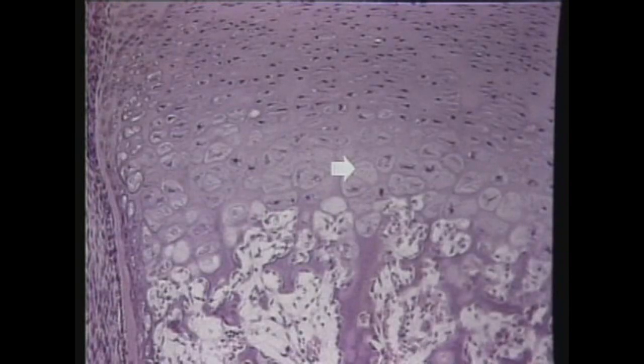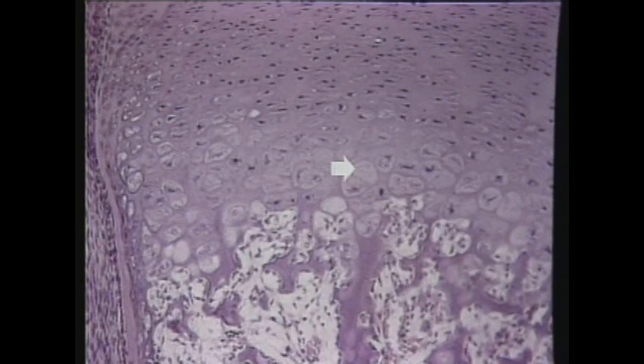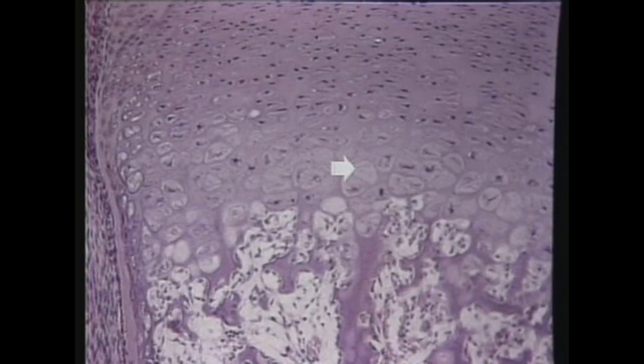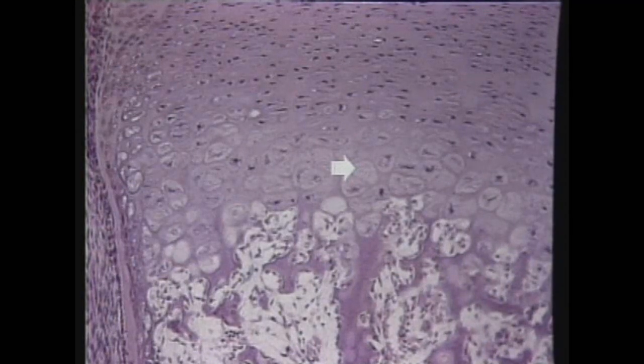Question number nine. What region is the arrow pointing to here? The arrow is pointing to the zone of hypertrophic cartilage, which is in the epiphyseal plate.